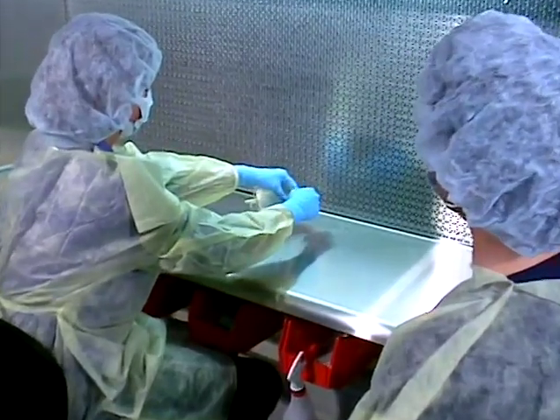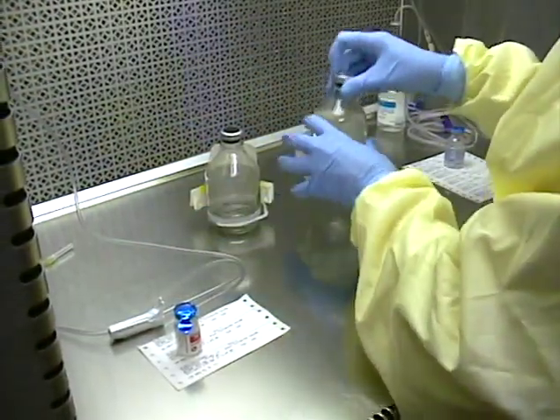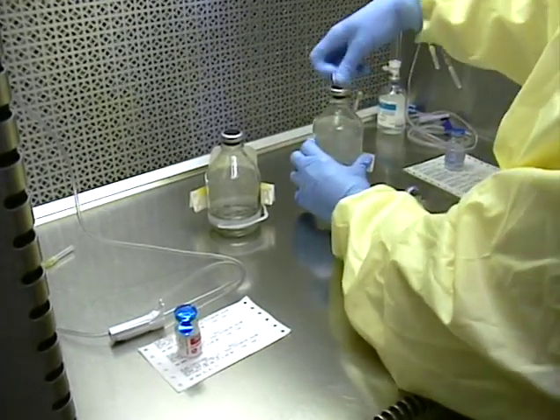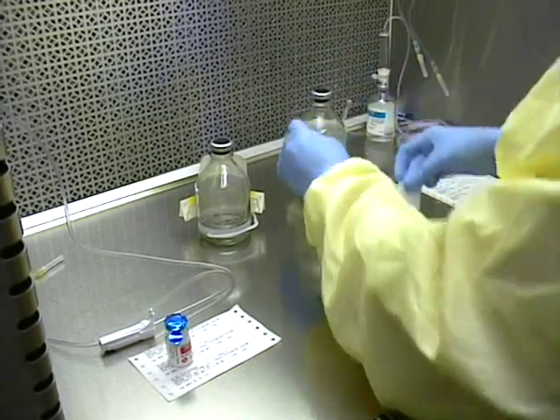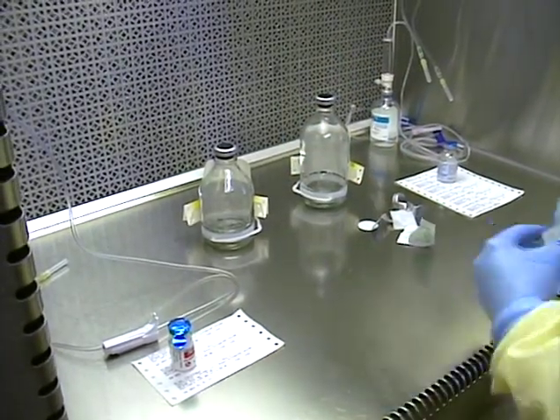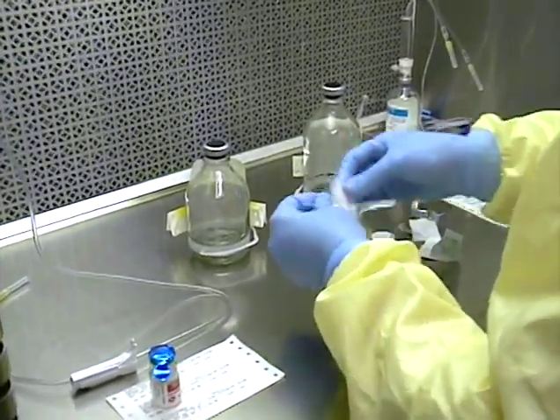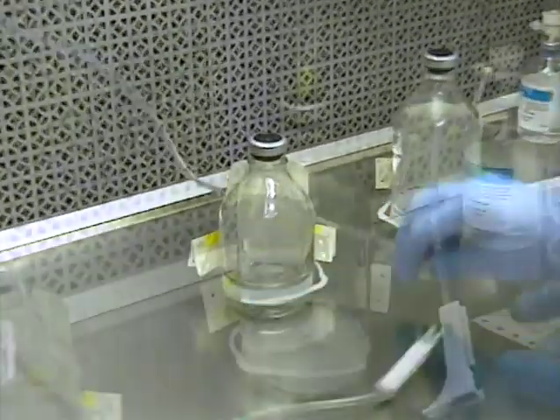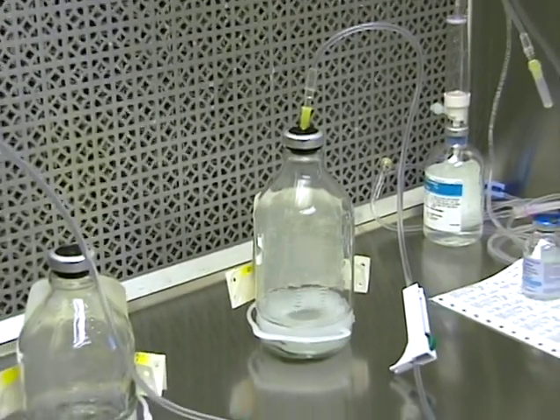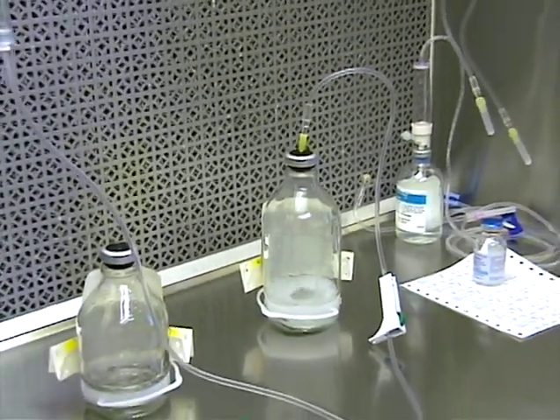Good techniques are as hard to break as bad ones, and good aseptic technique must be practiced until it is a habit. When it's applied properly, good aseptic technique is like a well-choreographed dance, with each and every movement carefully planned and executed, with no variation.